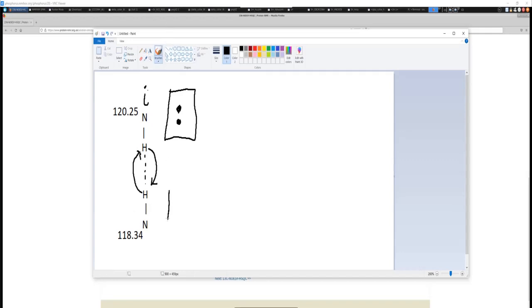And it's of course going to have its own strip as well. So if we look at its strip, say this nitrogen, this hydrogen that's connected to this backbone, it has a chemical shift here. Well, this sees this adjacent nearby amide hydrogen here, and so it also shows up as well, right? And so let me draw a line. So this correlates to this, and this correlates to this. So you can see that they both share each other's respective hydrogens' chemical shifts.